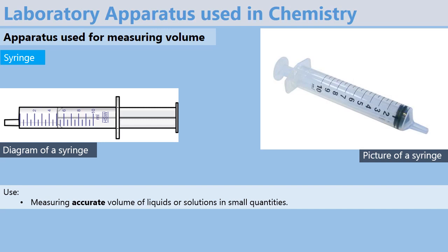For instance, in this diagram, you can see that the piston of the syringe shows that the volume in this syringe is 5 milliliters, slightly over 5. Anyway, you're going to meet these apparatus and interact with them. It's going to be very easy and a lot of fun.